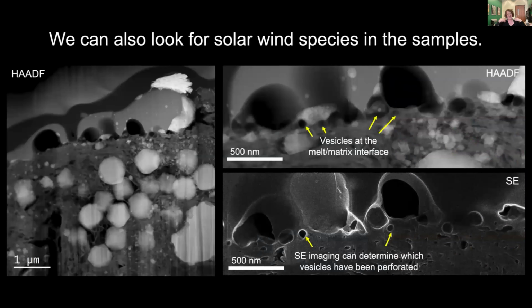Now, I've talked a lot about evidence for micrometeorite impacts, but we can also look for evidence of solar wind irradiation, the hydrogen and helium ions that are being implanted into the samples. And when we look for features related to solar wind, we focused on these small bubbles or vesicles that are right at the intersection between this overlying melt deposit and all of the regular material in the sample itself. We could use secondary electron imaging in the TEM in order to see in the FIB section which of these vesicles have been perforated and which vesicles are actually still intact, so that we could try and identify the hydrogen and helium directly in the sample to prove that they were containing species from the solar wind.